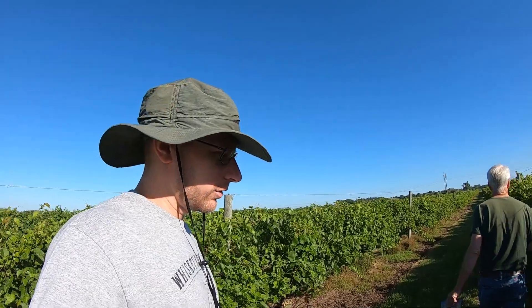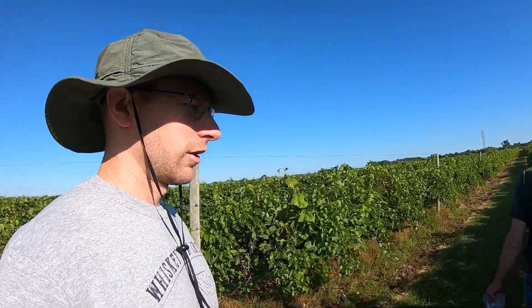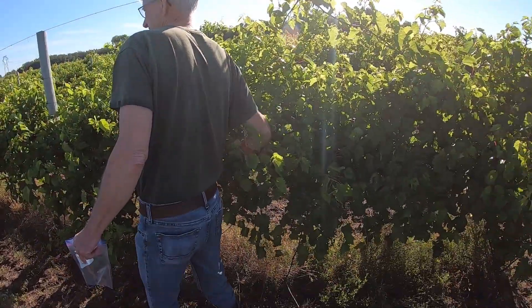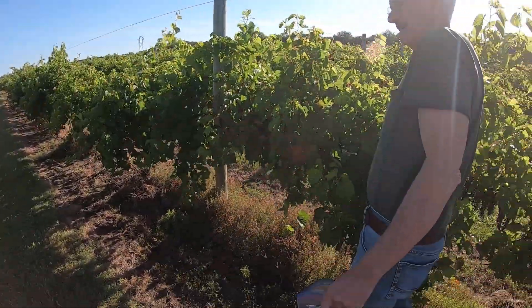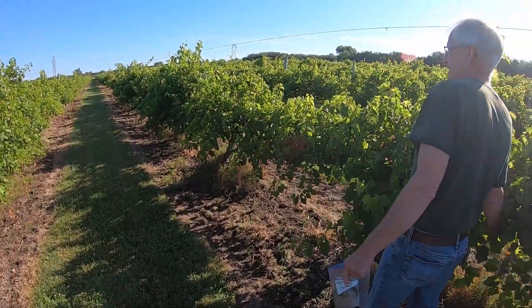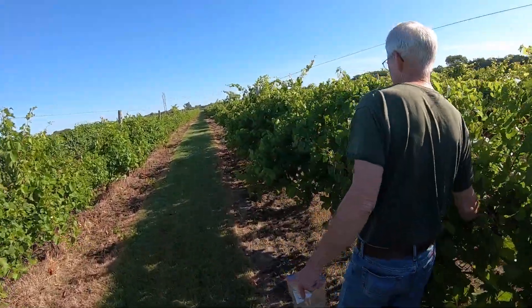We are back out here in the vineyard. We got to looking at our records and Frontenac was one of the earlier ones we picked last year, so we're out here getting samples for the Frontenac Brix and pH test. Dad's going randomly throughout the row — about every other plant on these because they're smaller berries. We're going over two rows and doing a sample from one side of the row.